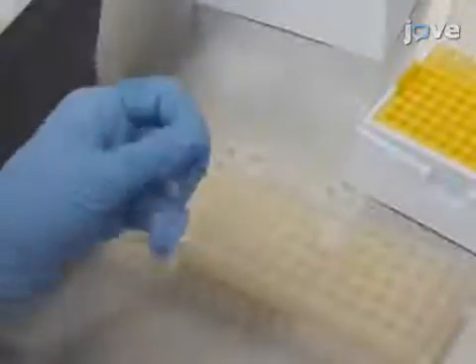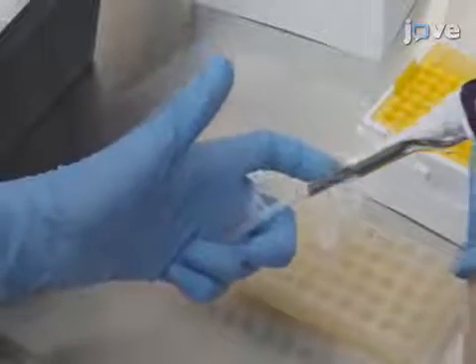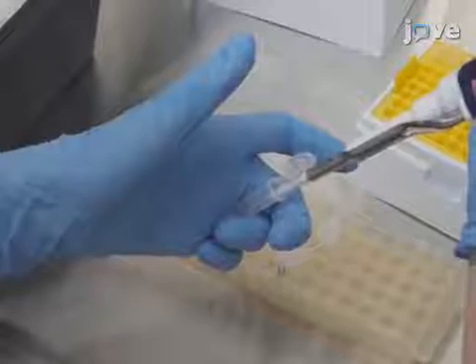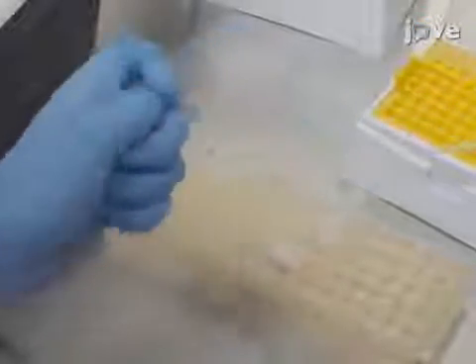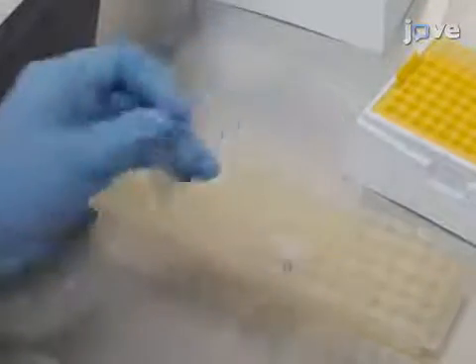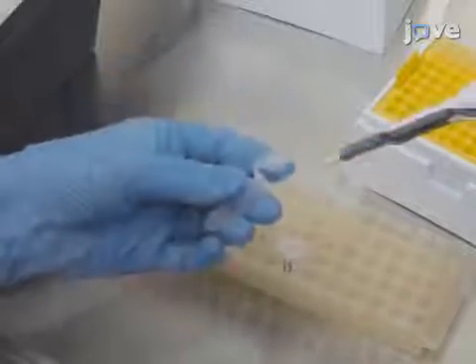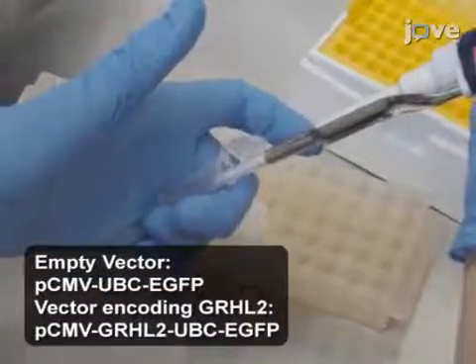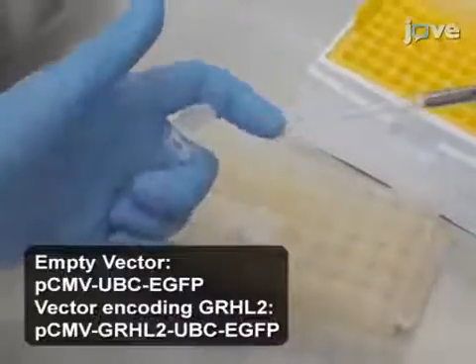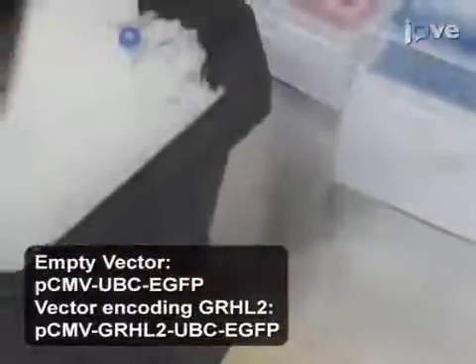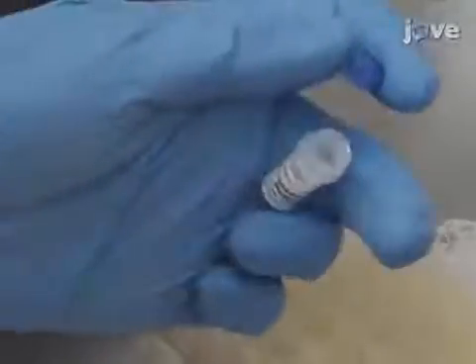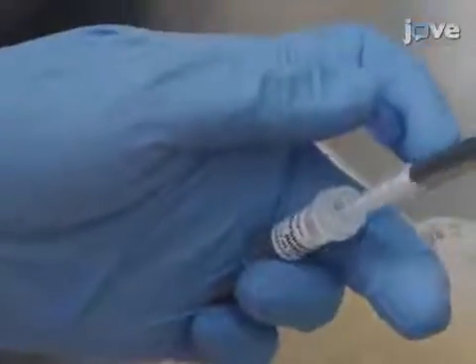Next, in separate tubes containing 200 microliters of serum-free medium with 1.8 micrograms of P-delta-8.9 and 0.2 micrograms of PCMV-VSVG helper plasmids, dilute two micrograms of the empty vector and two micrograms of the vector containing GRHL2. In another tube, dilute four microliters of a lipid-based transfection reagent in 200 microliters of serum-free medium per transfection.